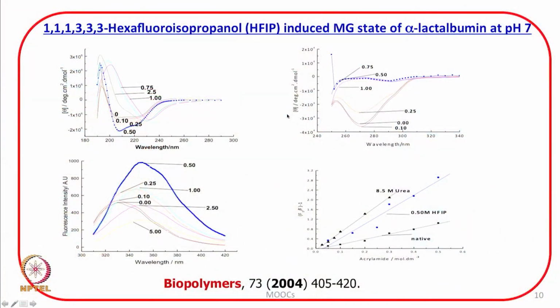If we look at the upper panels, these are the far UV CD and near UV CD spectra of alpha lactalbumin in presence of different concentrations of hexafluoroisopropanol.